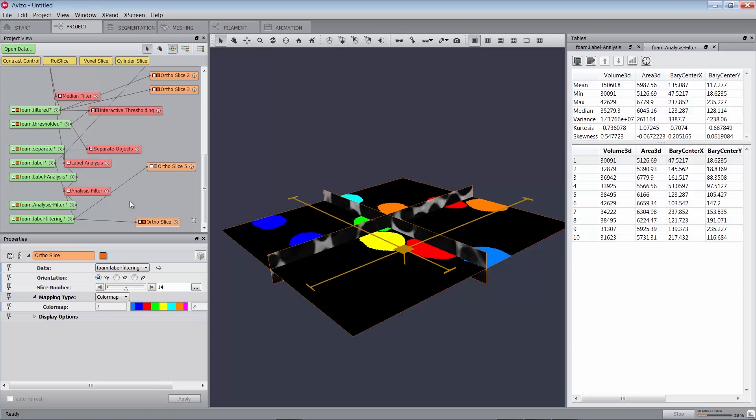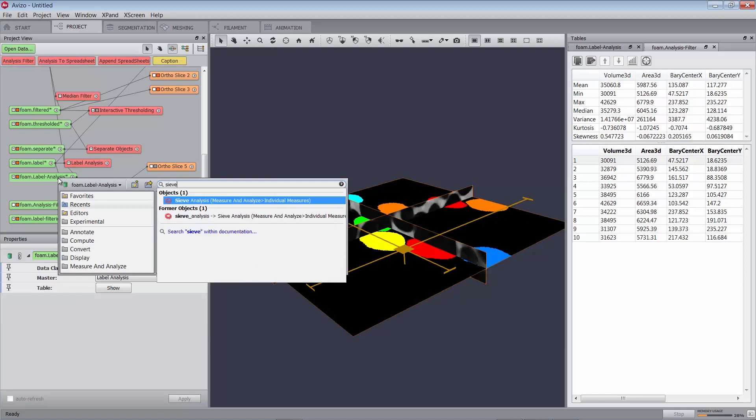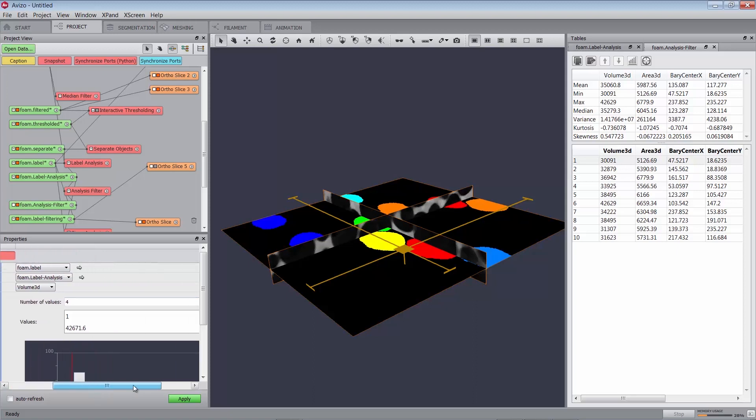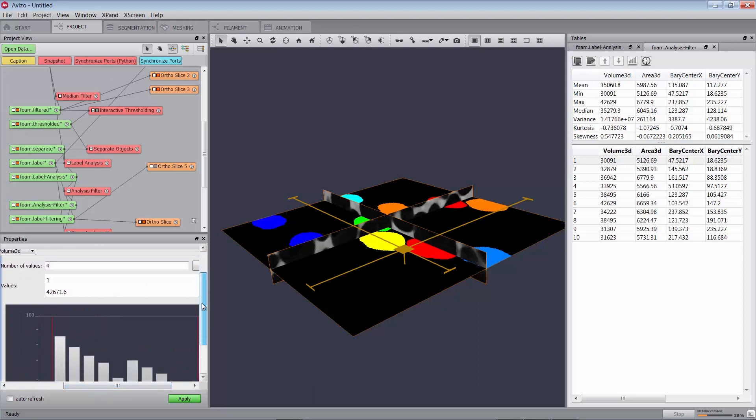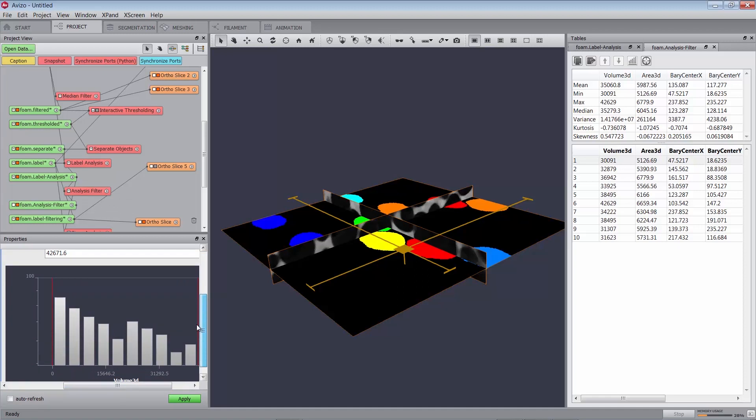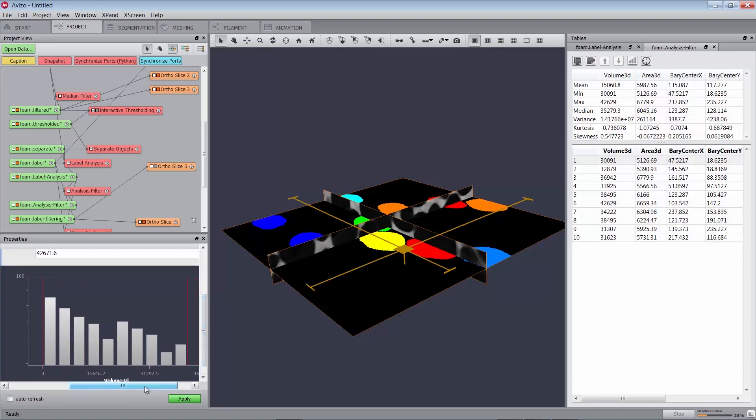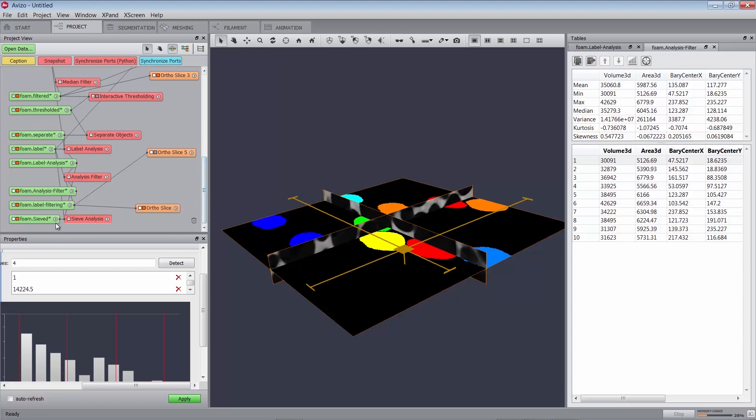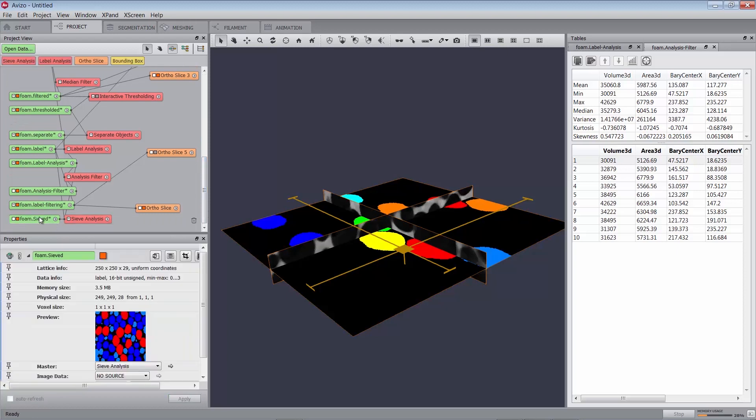Classifying measures with sieves. You can define a set of value ranges that can then be used for displaying a histogram using this distribution, or for creating a new label image showing the classification. Attach a sieve analysis module to foam.label-analysis. Connect the data port to foam.label. Add a value by changing the number of values to 4, or modify the suggested values by editing them or moving the corresponding marker in the histogram. You can also press on the detect button to get regular intervals. Press the apply button. A new label image, foam.sieved, has been created.